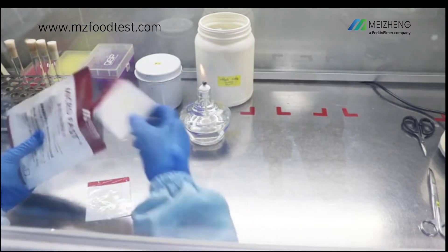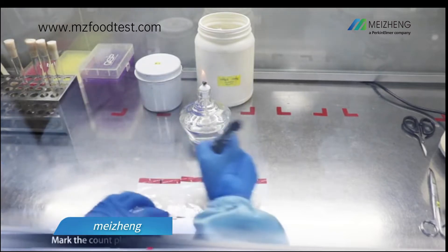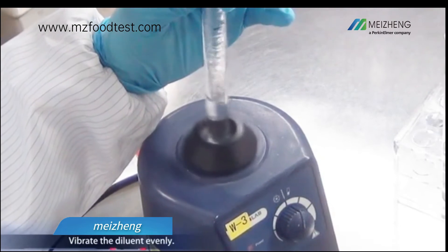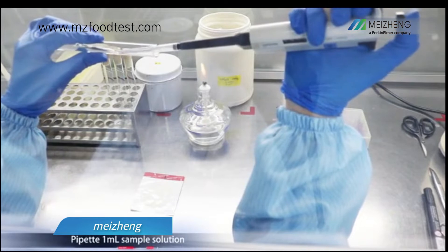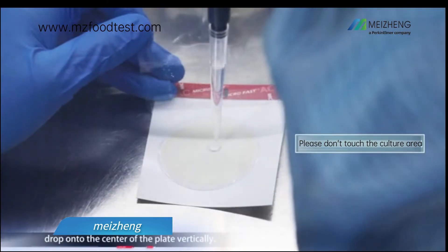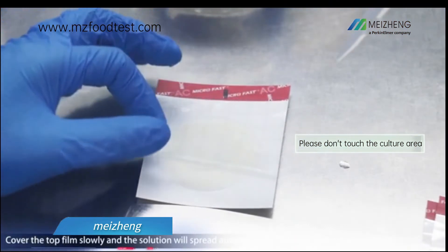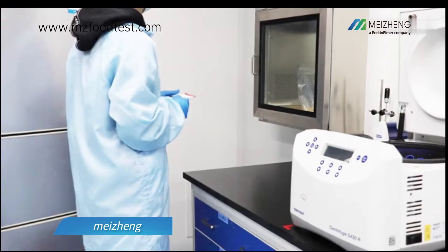Mark the count plates. Vibrate the diluent evenly. Pipette one milliliter of sample solution and drop it onto the center of the plate vertically. Cover the top film slowly and the solution will spread automatically. Pressing the plate is not required.